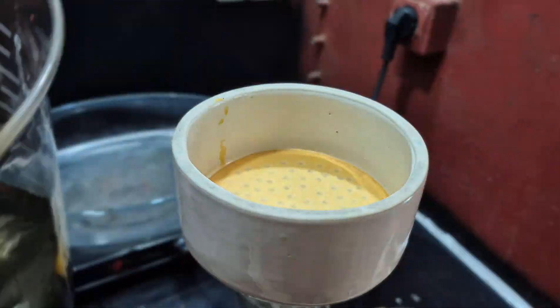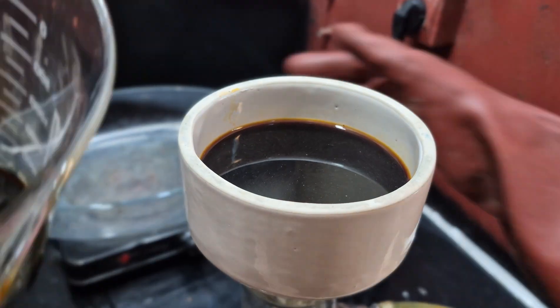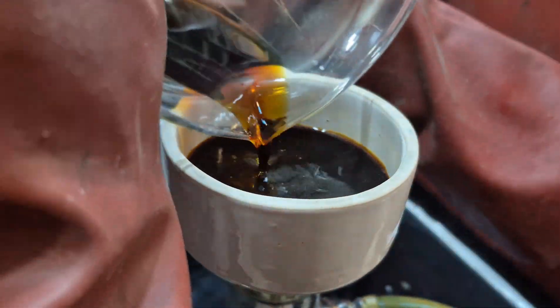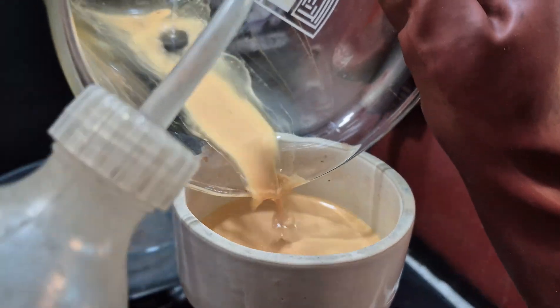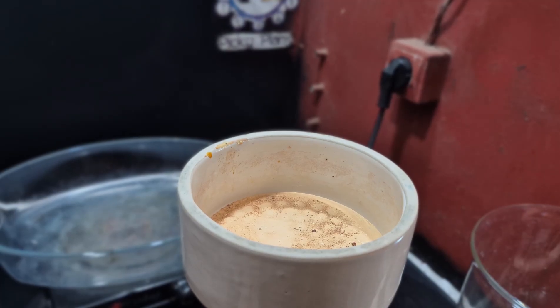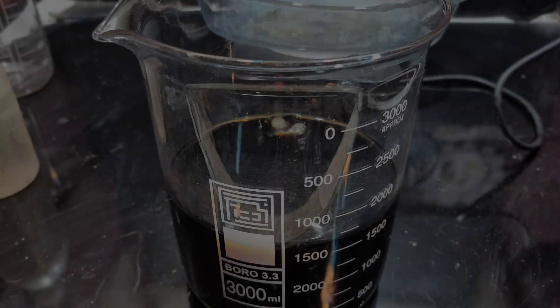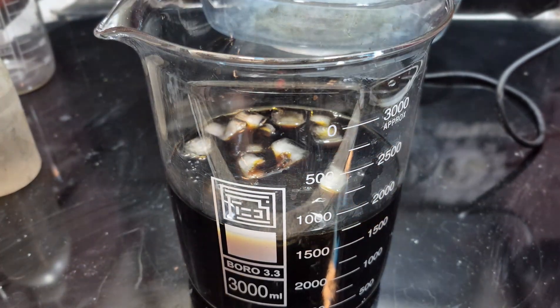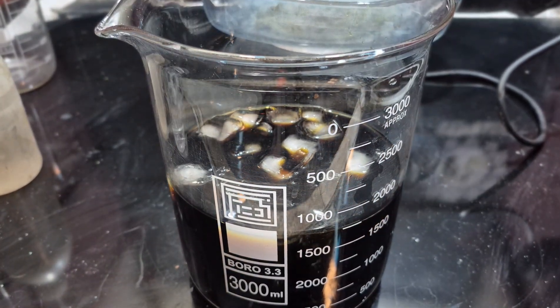After allowing the solution to rest for two hours, I proceeded with the filtration process to separate the solids from the liquid. The increase in volume is due to the washing step. Now it's time to precipitate the palladium in the form of a diamine chloride salt.